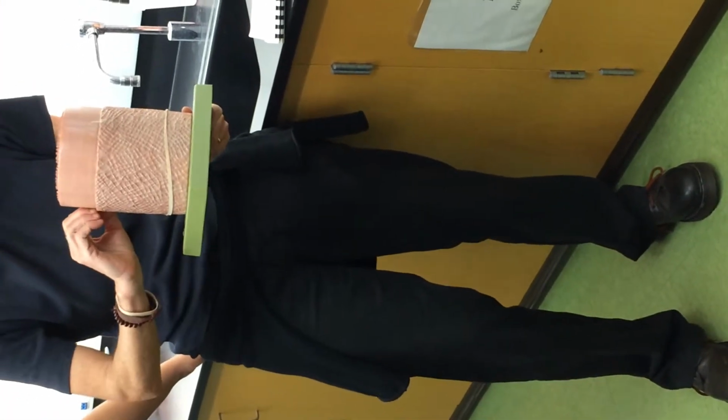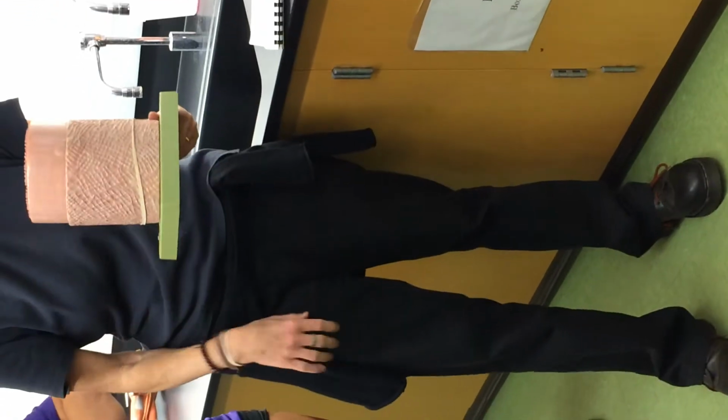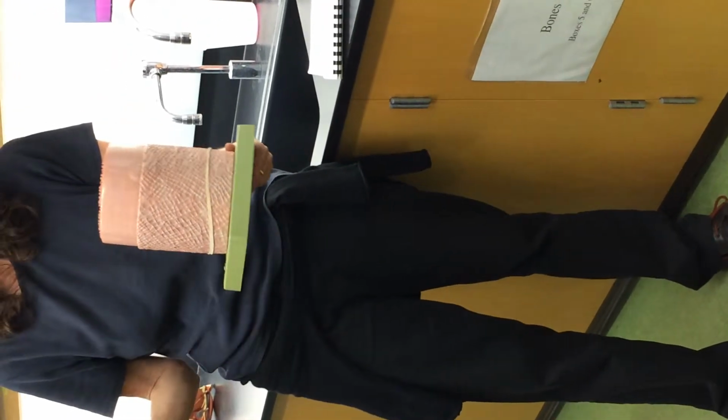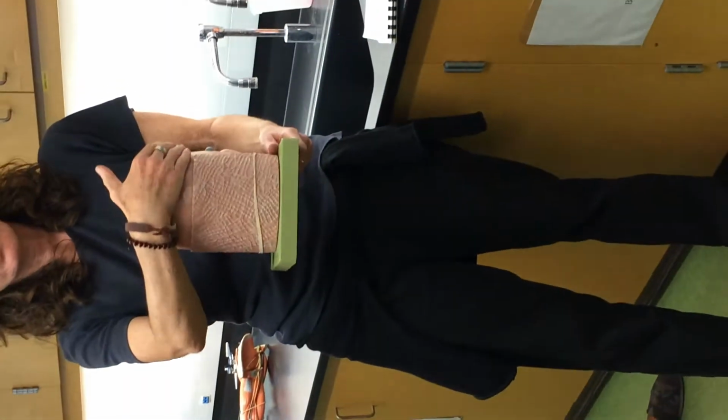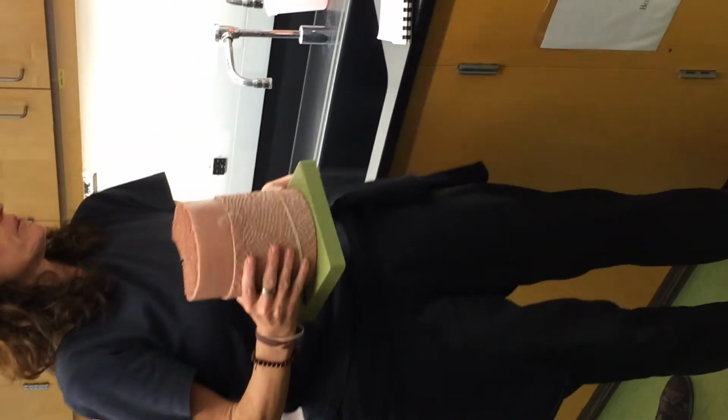That's the connective tissue. So what is this connective tissue? Oh, you guys are good. That's dense irregular connective tissue. That's good. Excellent. What's it called? Name that structure. Endomysium. What's the endomysium? Good. So we're catching those mistakes now. Right? So endo, because this is just one cell. A lot of people think those are cells, and they think that's the perimysium. It's not. Okay. So it's endomysium.